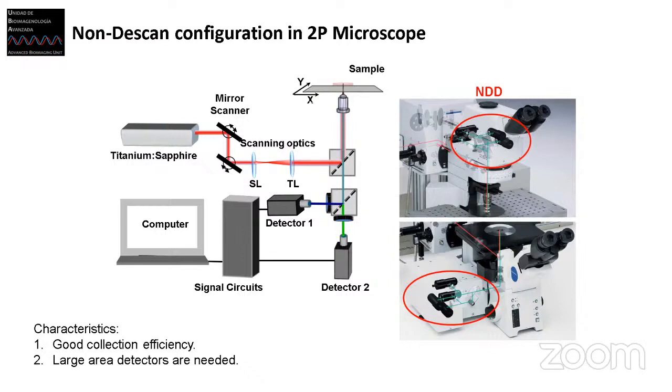And why? Well, this is possible because in two-photon excitation, we have intrinsic confocality. We don't need a pinhole. And this is very useful because in some situations we have such a weak fluorescence that if we waste most of the light passing through all this optic, you compromise the capability of doing images.